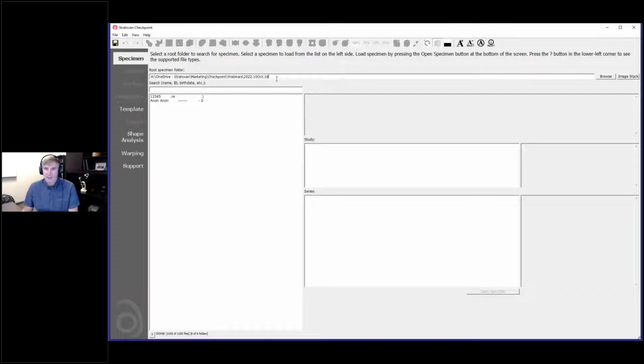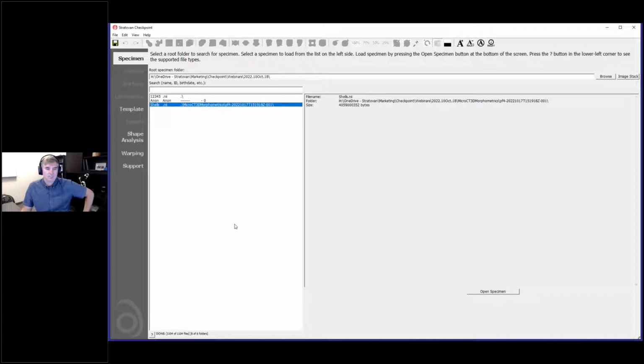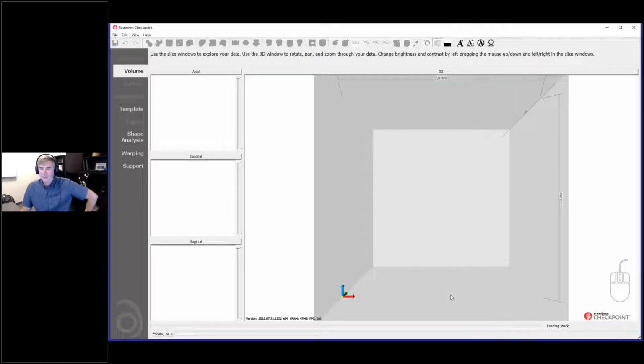So now if I update my folder, it pops up here. Here we go. So here's the file I just created. So I'm going to click open here. This again takes a little while since it's a large file, but we're almost there. Once we get it in here, things will speed up a little bit.